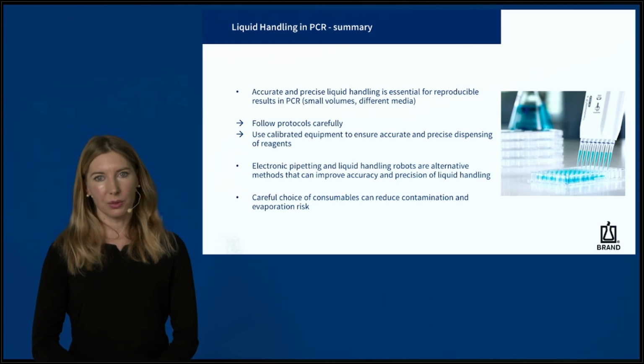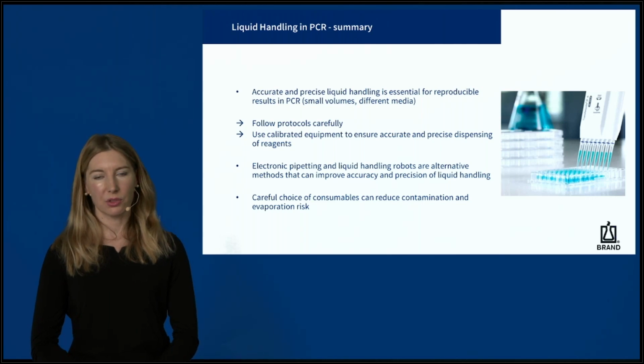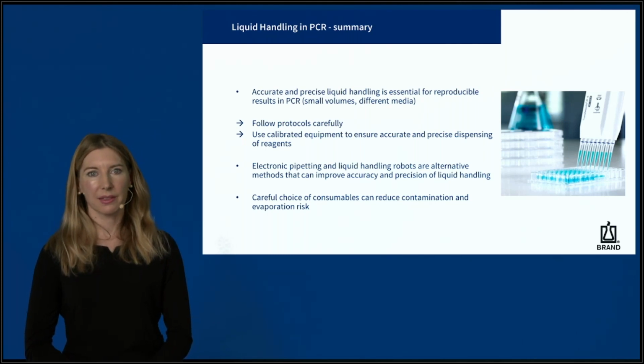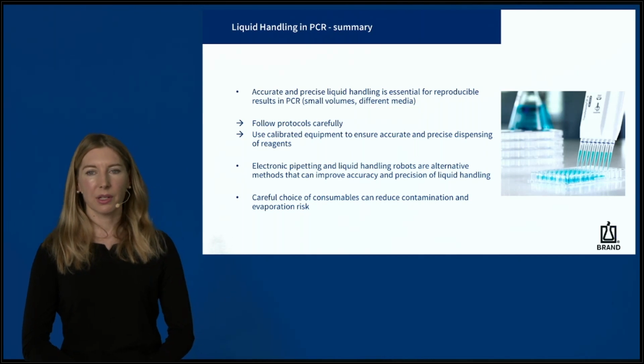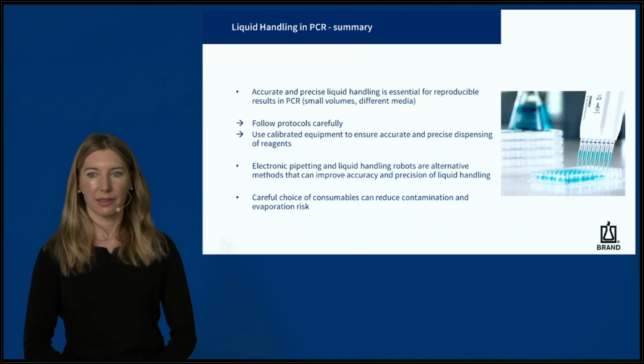Regardless of the method used, it is important to follow the protocols carefully and to use calibrated equipment to ensure accurate and precise dispensing of reagents. Make sure that your PCR consumables are free of substances which interfere with your PCR products. Reduce the contamination and evaporation risk for reproducible results.